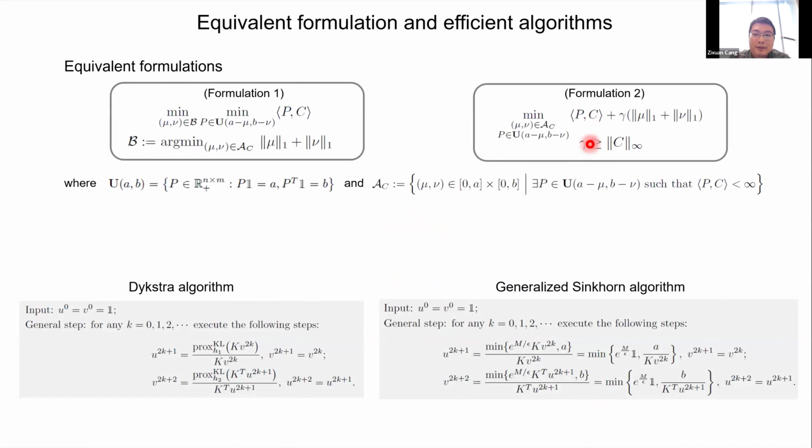which we prove that we can achieve a simpler equivalent form, from which we can derive efficient algorithms. So just for an idea of the efficiency of these algorithms, we're able to look at 1,000 pairs of ligand receptors at the same time, considering all the competitions among them, using a medium grade laptop to compute in a reasonable amount of time.